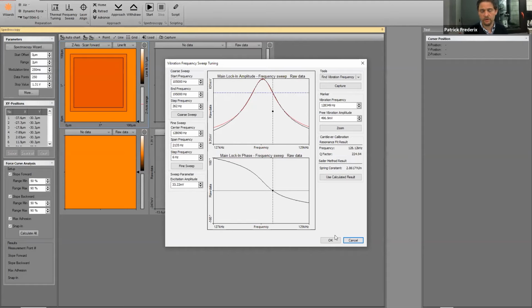Then to the second part, what is the lateral range you should take? Generally I first map and look at the object sizes in the map and the homogeneity or heterogeneity. Based on what I see there, I can decide whether I need a larger or possibly a smaller area. Probably better to start a bit larger and then, if needed, zoom in.